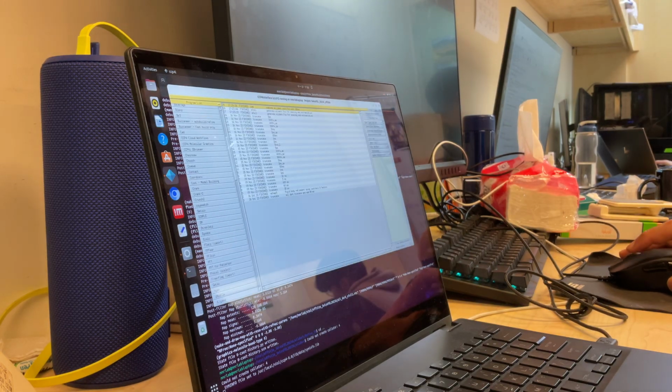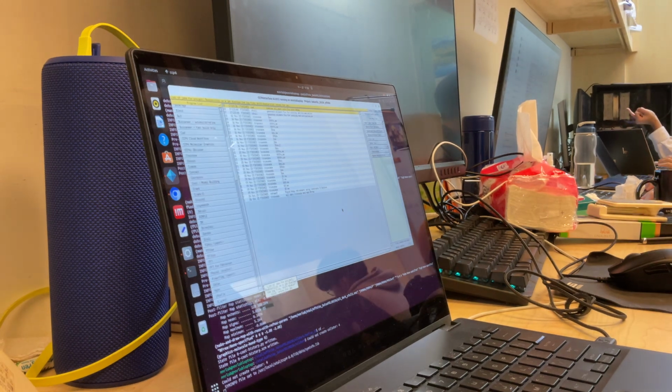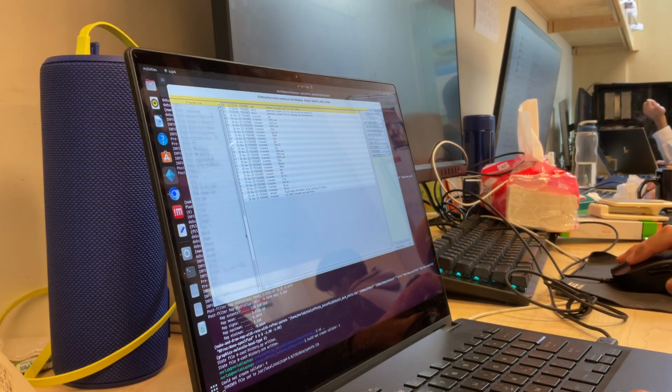So now we take this, and the next step is to scale it. Now we need to scale the 180 picoseconds to the F dark, which we have scaled itself against the FC dark. So now we will use the F dark, which has been scaled to FC dark, to scale the 180 picoseconds so that we have everything in the same scale. To do so, we use the program SCALEIT.